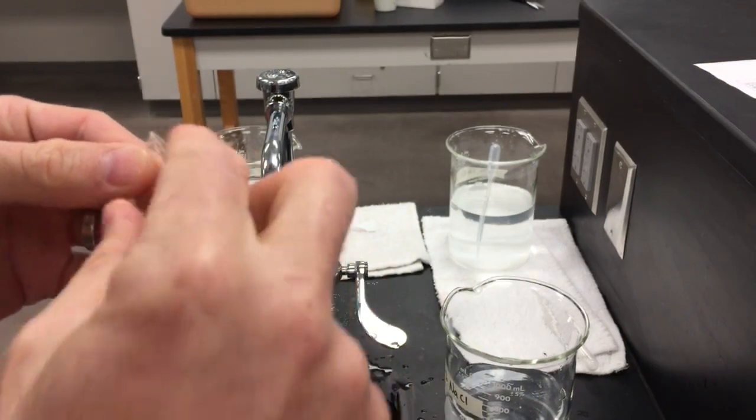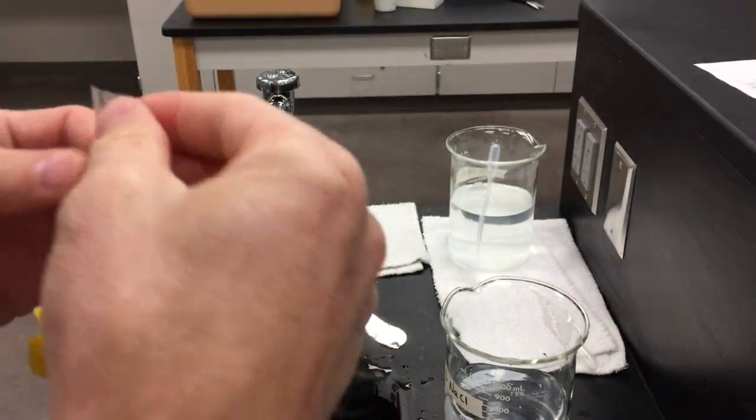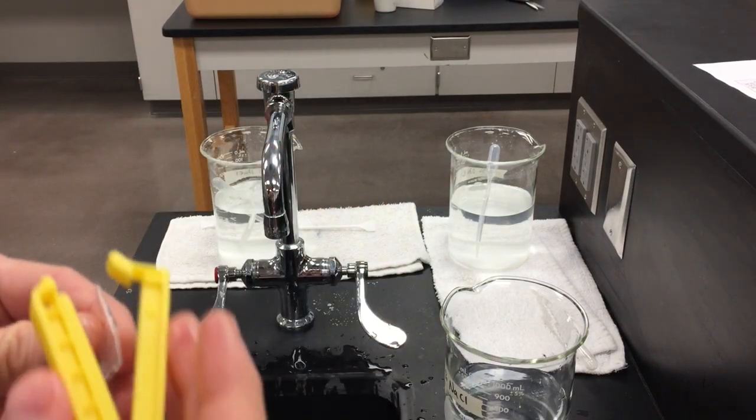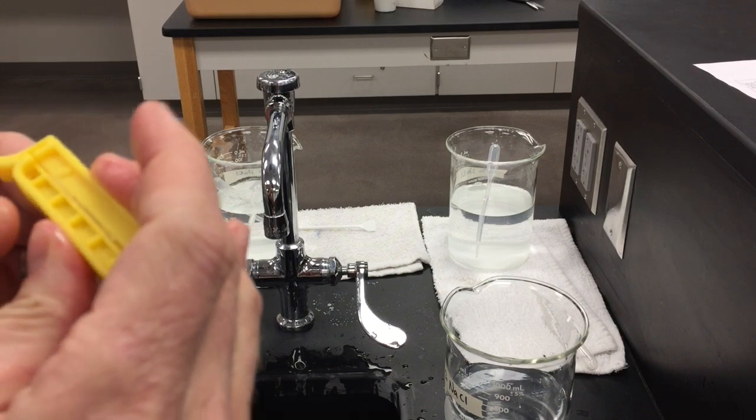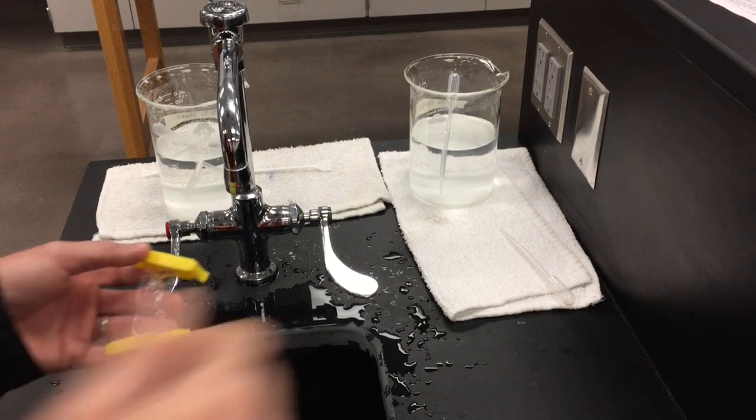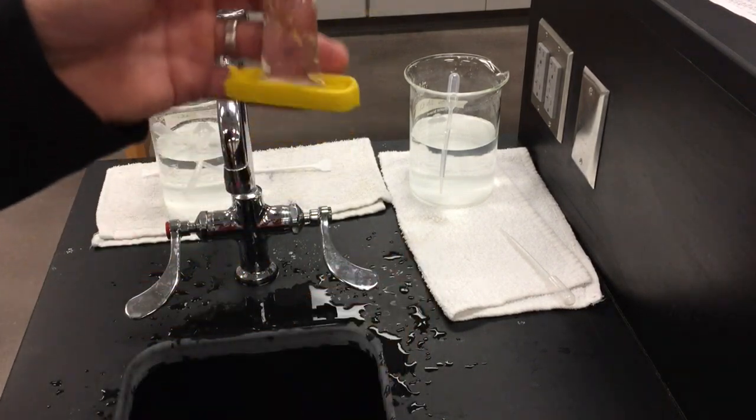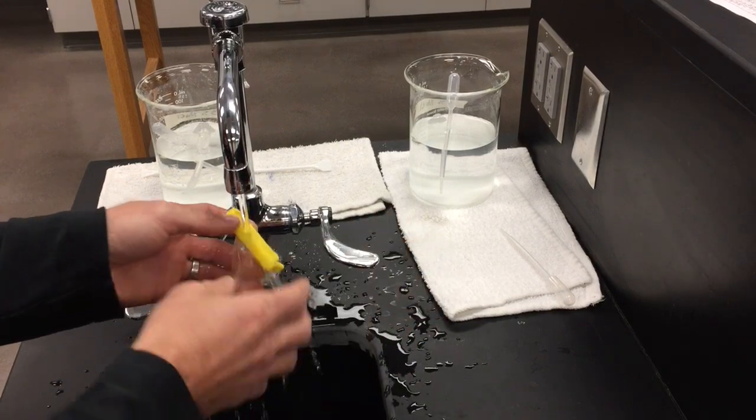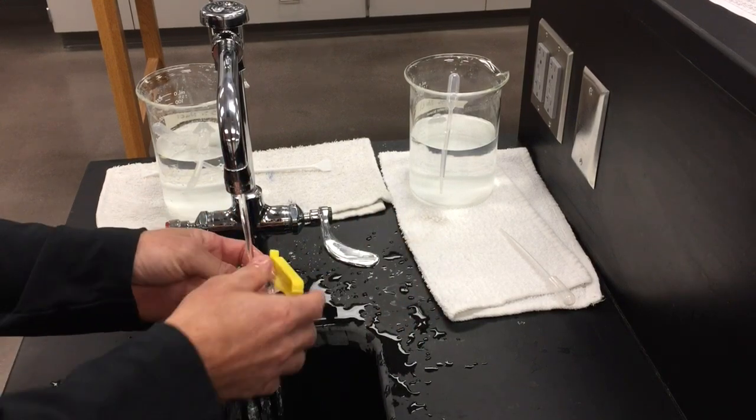I'm going to fold over the end and clamp that end up as well. If there's any bubbles in there, try to get the bubbles out and then clamp the end shut. Once you've added the salt water to the dialysis tubing, rinse off the tubing for a while to get any excess salt water off the outside of the tubing.